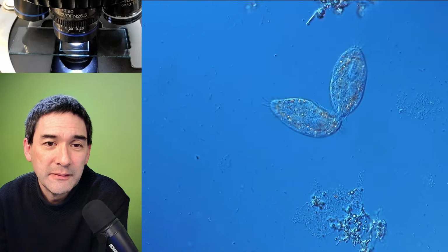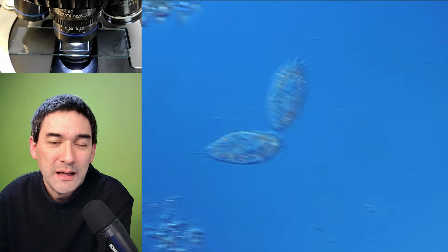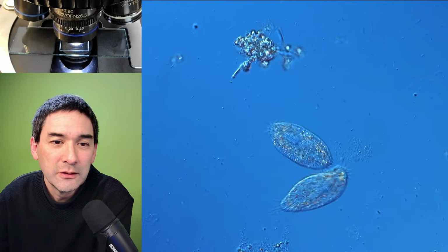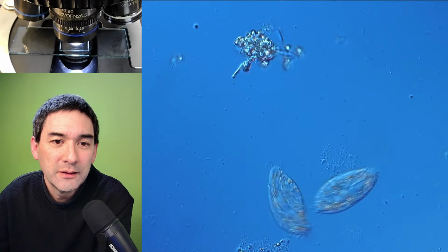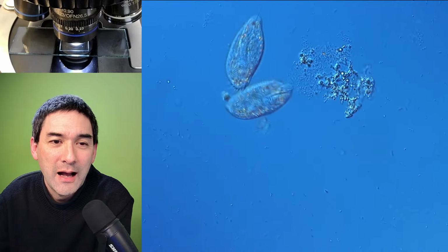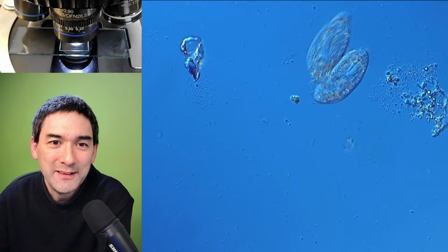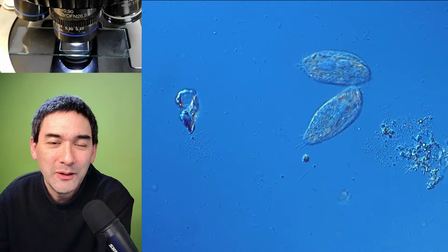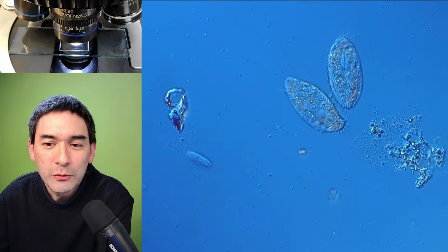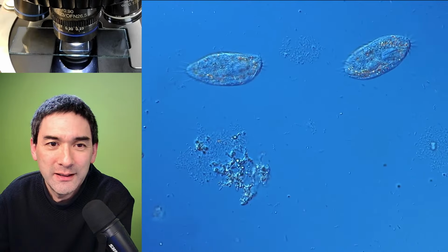Look. Oh, very nice. Look, look, look! Ha! They separated. Or are they still a little bit connected? No, I don't think that these are microplastics. Okay. Here we go. Ta-da!